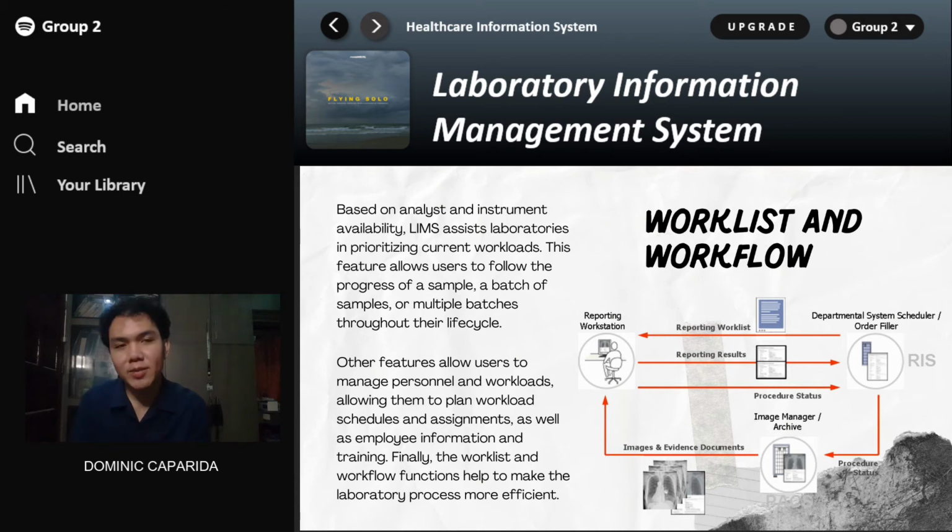This department system scheduler or the order filler may be the information system. They will provide the reporting work list, and they will pass it to the reporting workstation. Then this reporting workstation may be the nurses, the staff, the receptionist, and the medical technologist in the laboratory. They will be the ones who plan and take actions on the workload. And as they finish, they will report the results back to the information system or the order filler.